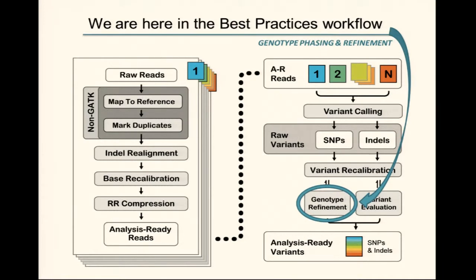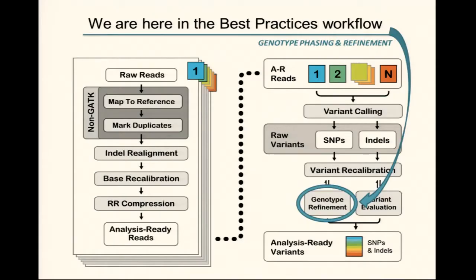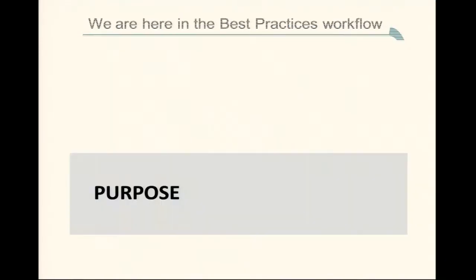So what we do is we provide a kind of windowed view of the data that has likelihoods and genotypes based on a kind of local context where we've enforced none of the conditions of biology except for ploidy. We don't restrict to Mendelian transmission. We don't look at other variants nearby in order to leverage things like LD or D prime to inform the genotypes. We don't look at family structure in order to assess phase. And so this branch of the workflow allows us to look outside of this local view in order to improve the genotypes and generate additional information such as phasing.